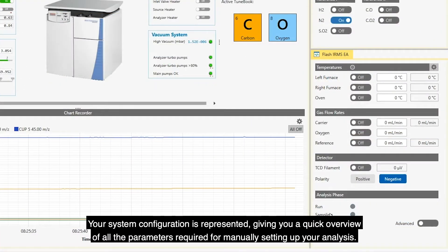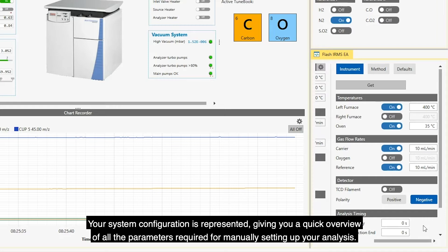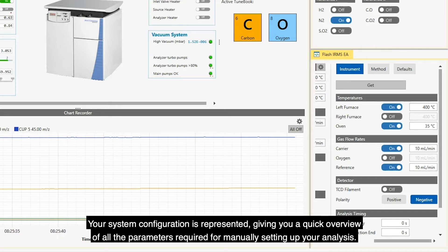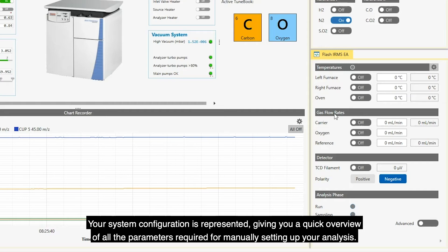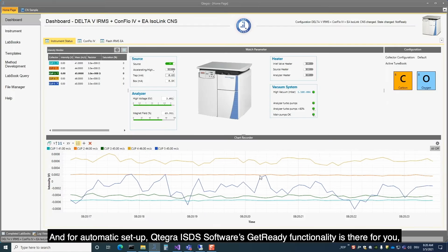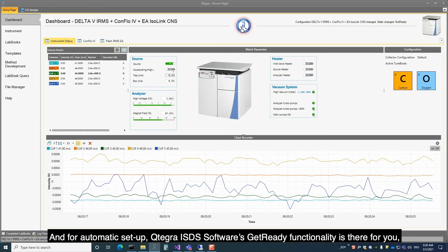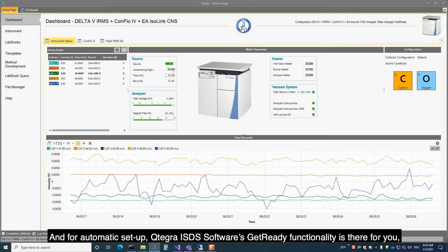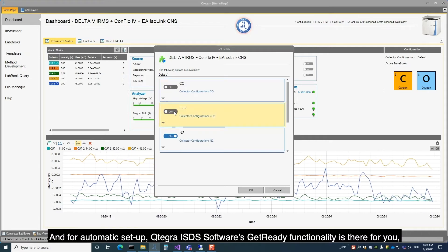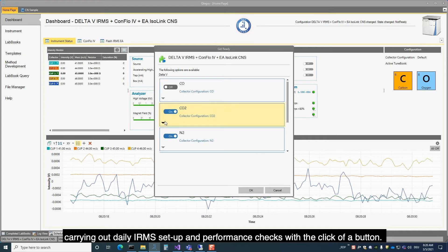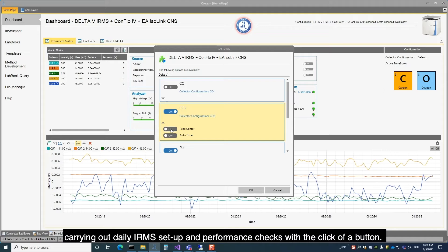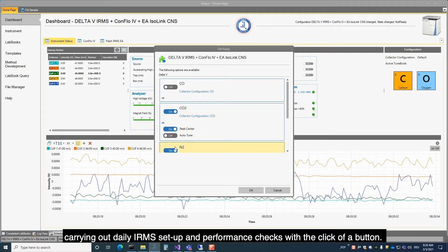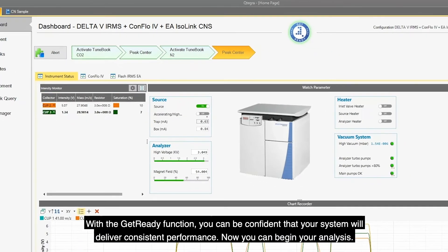Your system configuration is represented, giving you a quick overview of all the parameters required for manually setting up your analysis. And for automatic setup, Qtegra ISDS Software's Get Ready functionality is there for you, carrying out daily IRMS setup and performance checks with a click of a button.